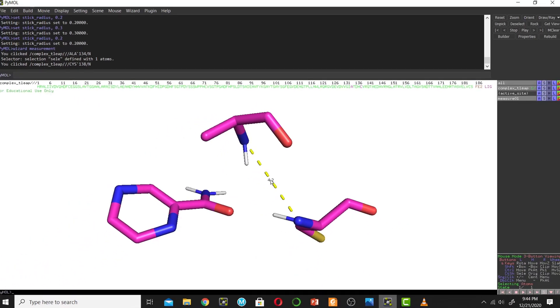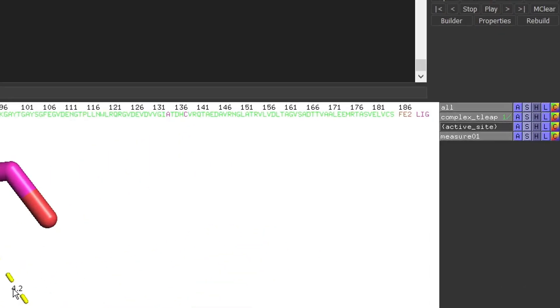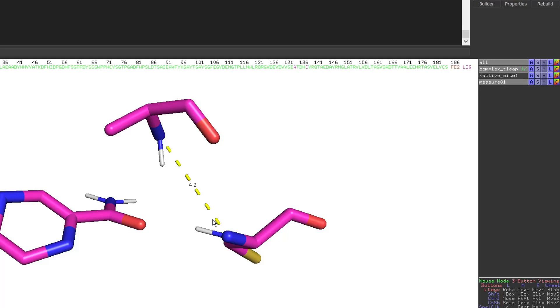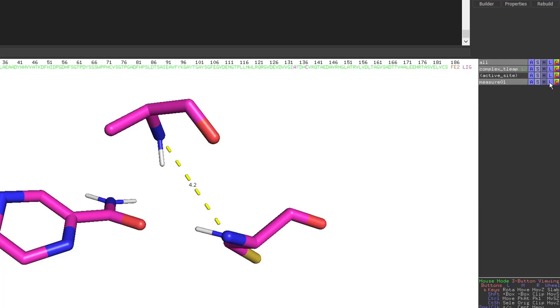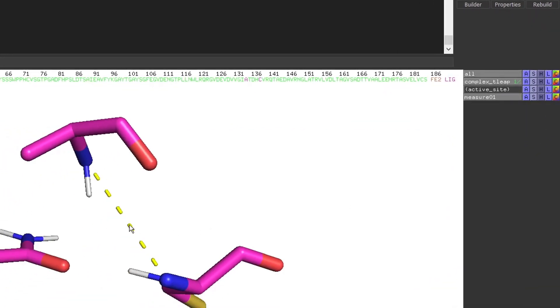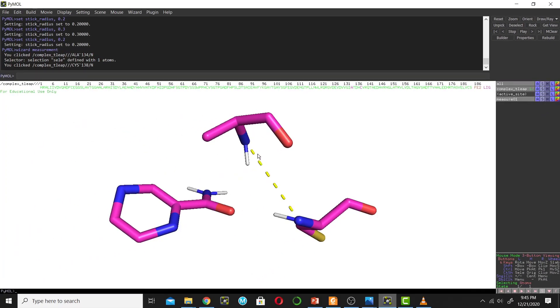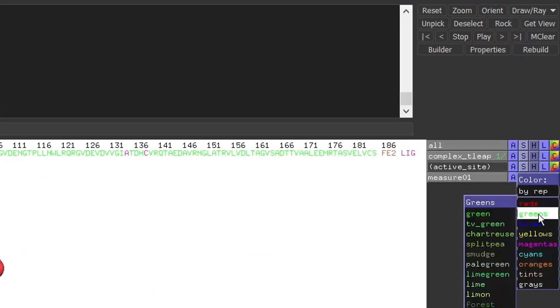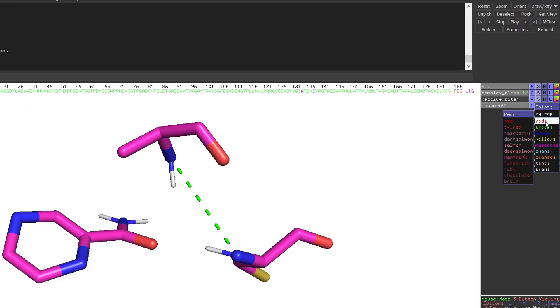I will hide the distance label showing 4.2 angstroms. Go next to Measure 1 — you can toggle the measurement on and off using the measure button. I want to show the distance line but hide the label, so go to Measure 1, click Hide, and hide Labels. You can also hide or show the dashes, and you can change the color of the distance line — currently yellow, but you can change it to green or red.